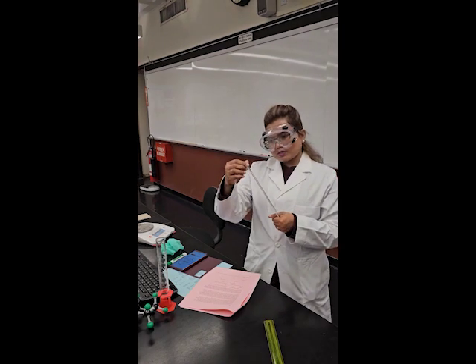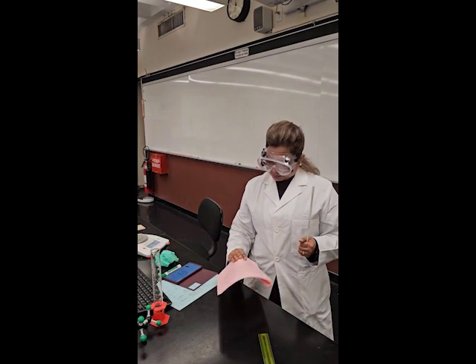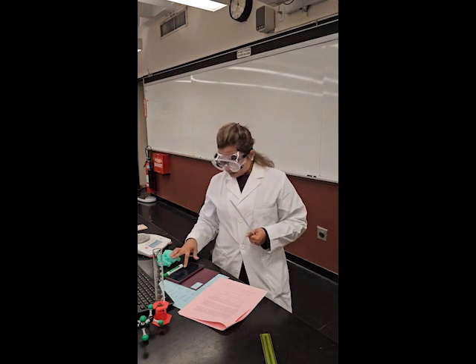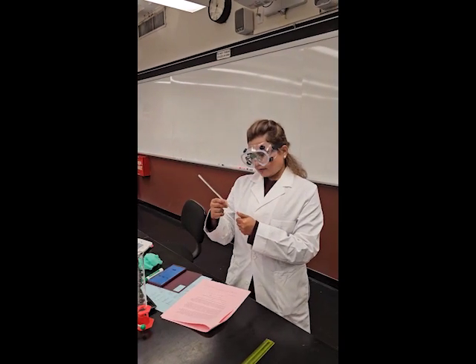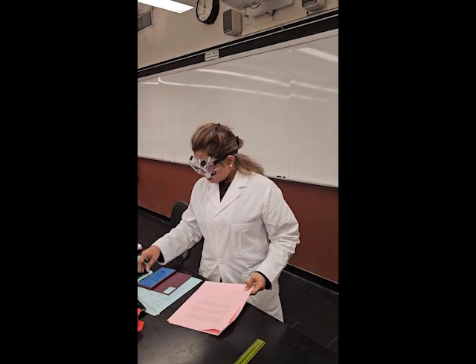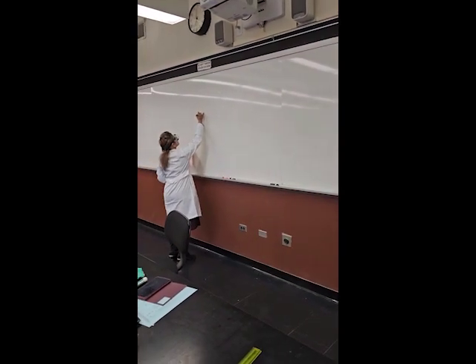Oh, this thermometer is in degrees Celsius, and your lab manual is asking in Fahrenheit. You can easily convert it. That's not a big deal. Get the temperature. Okay, so after 5 minutes, I can see on my thermometer, my temperature is 36.6 degrees Celsius. Okay, so now I'm trying to convert it from degrees Celsius to Fahrenheit. My human temperature.